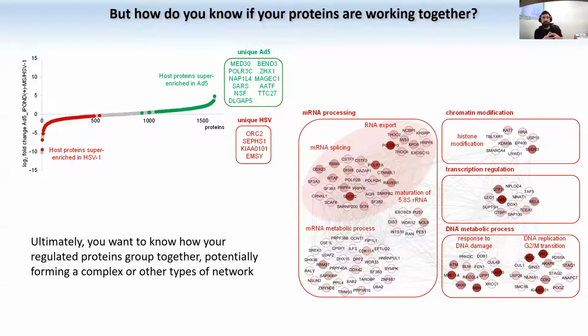So here you start to actually look at proteins not just in numbers, but also in terms of spatial distribution for those that have similar biological functions. And now it becomes much easier to recognize your data. Right? And then you probably notice that your proteins are connected by some lines that are very faint, but you can see them in the background. So the next question is, how do I know that these two proteins have some sort of interaction? And for example, this one and this one, they do not.